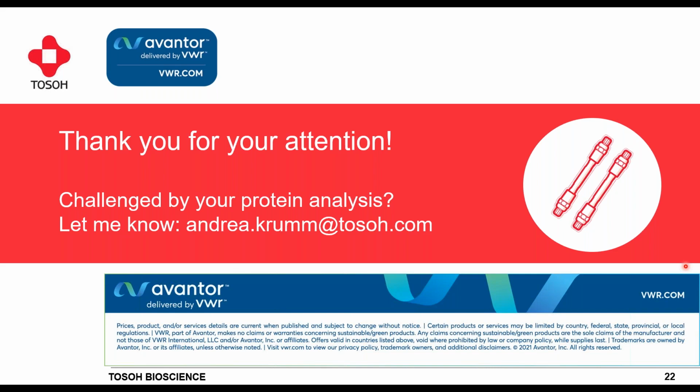Was the new butyl column tested with molecules other than ADC? Yes, we did test it. We did test it with other proteins, and actually it worked very well. What we used it for was monoclonal antibodies without the attachment of a drug, or just simple protein standards, for instance. And there we also saw that superior separation performance, resolution of the column, just like for the ADCs. But it's all been protein-based molecules up to now.